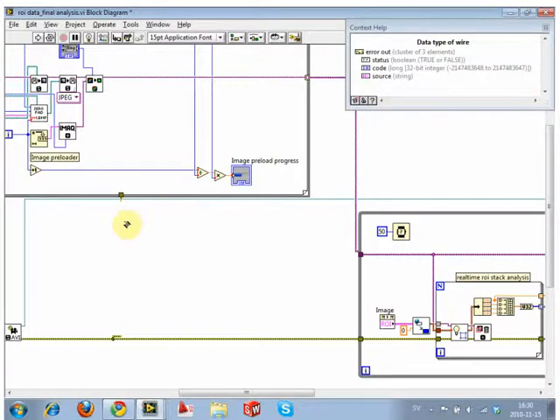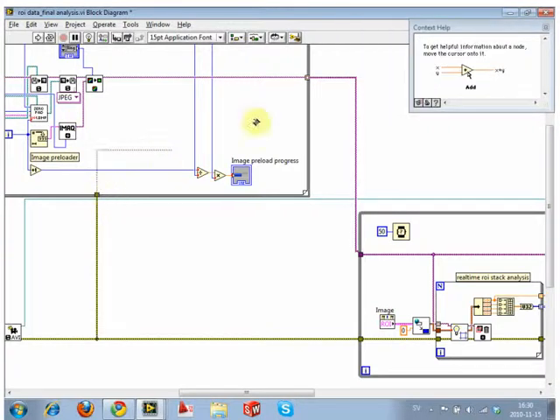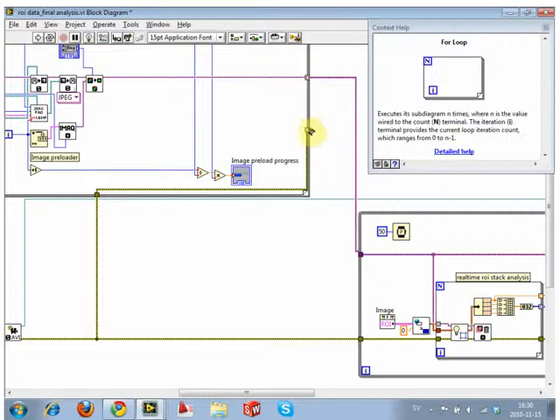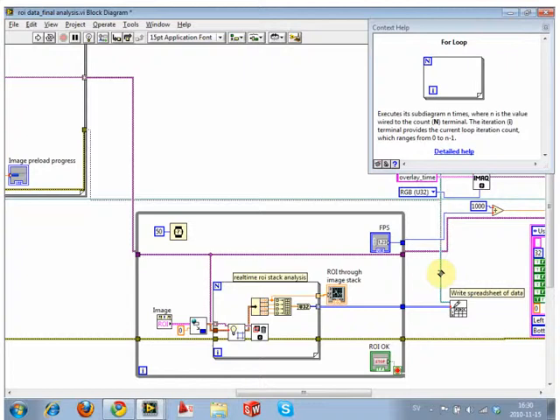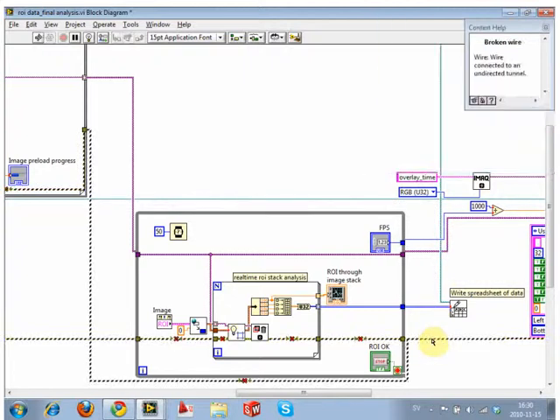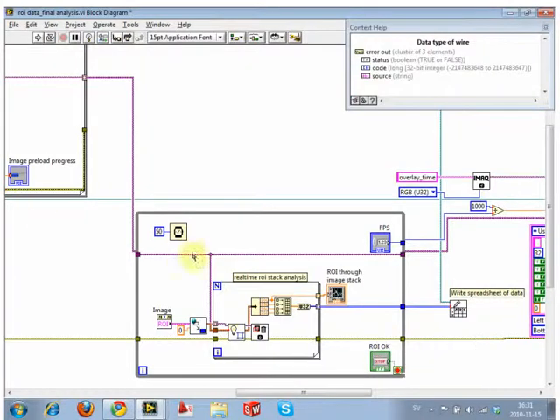So if I do this and say, you run up here, and then run through this data set to here, disable this tunneling, and then pick up one over here and say I want you to combine these errors over here, then it'll say, what's that? It can't go both ways at the same time. It's basically saying, I can't go to both these branches simultaneously and then meet them simultaneously.